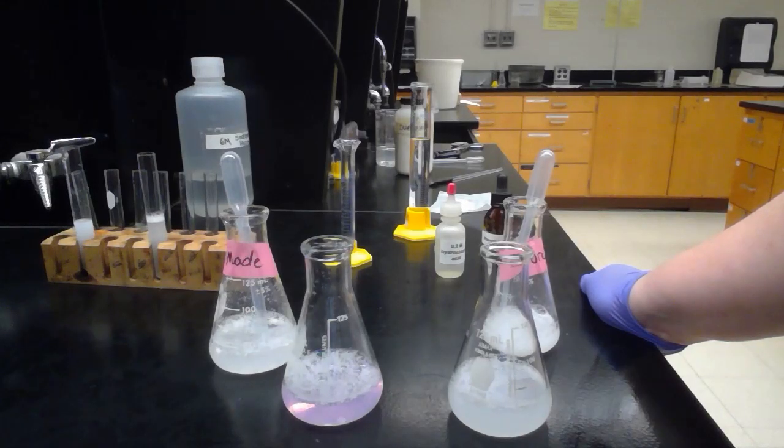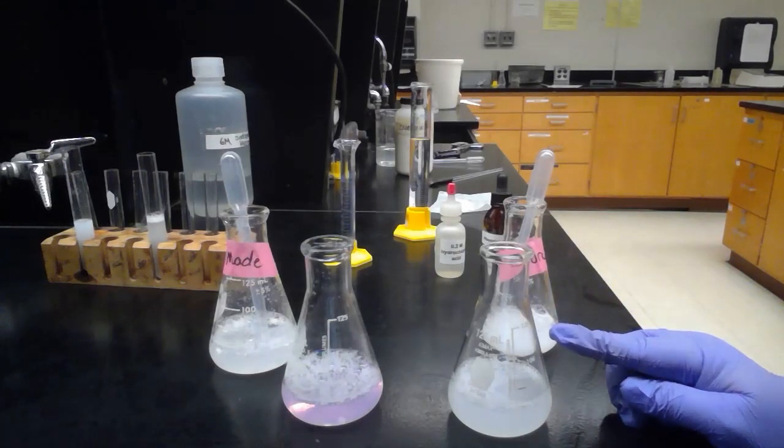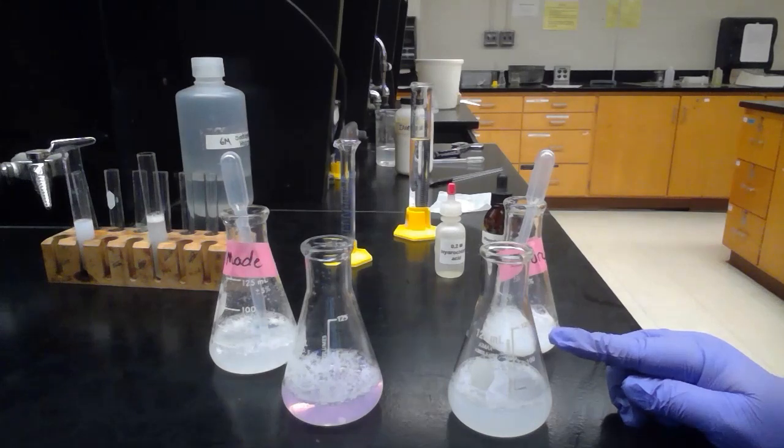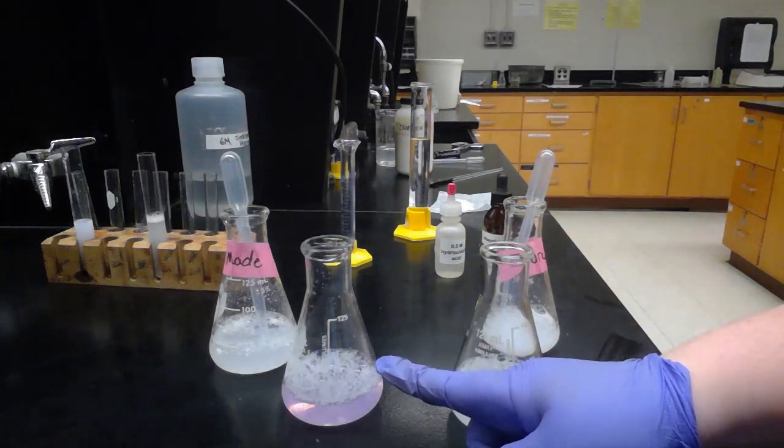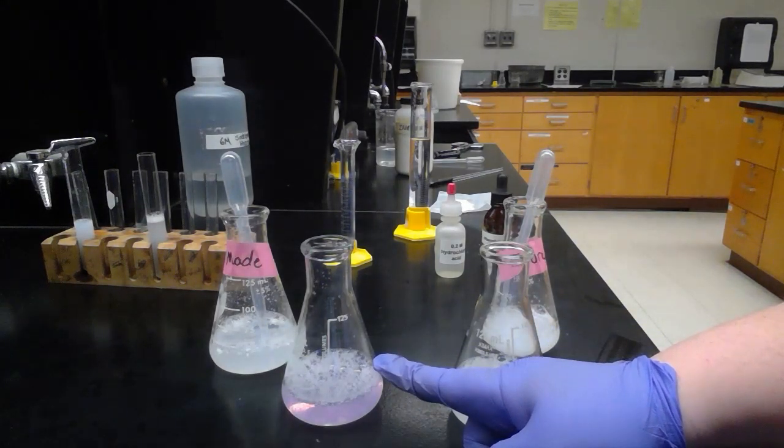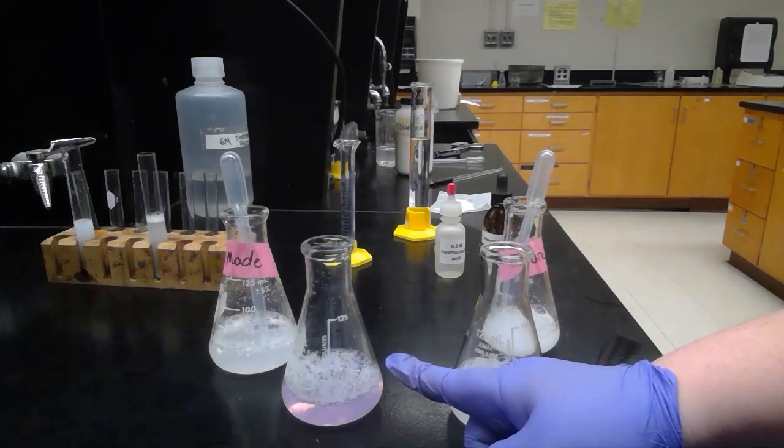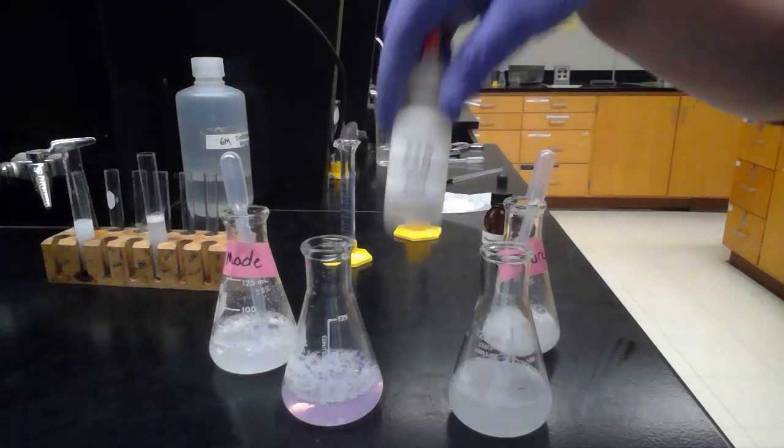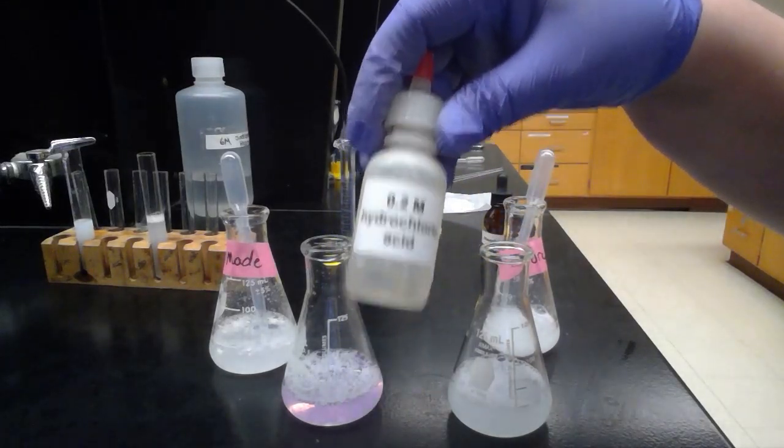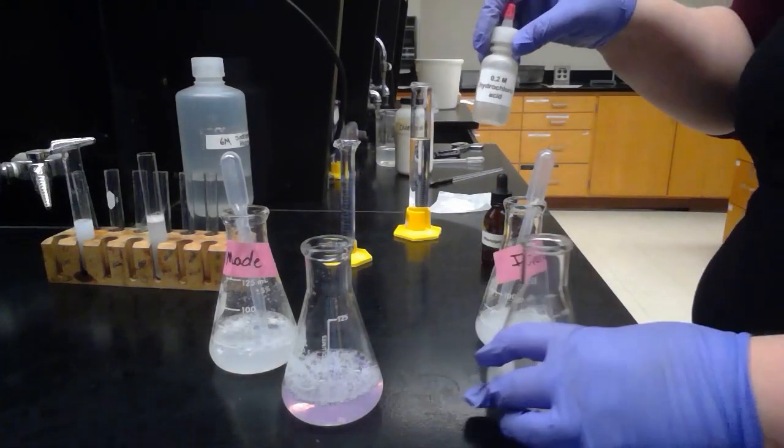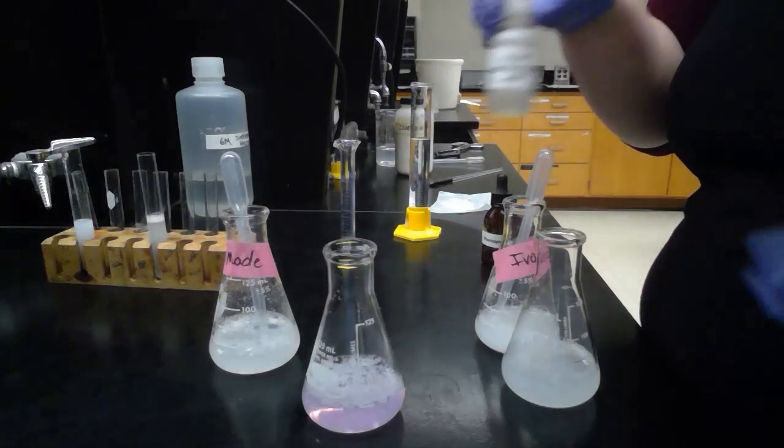We didn't have to add any hydrochloric acid to neutralize the ivory soap. But now we're going to try to neutralize our sample or our made soap by adding one drop at a time of our 0.2 molar hydrochloric acid, and seeing how many drops it takes to get this pink color to disappear.